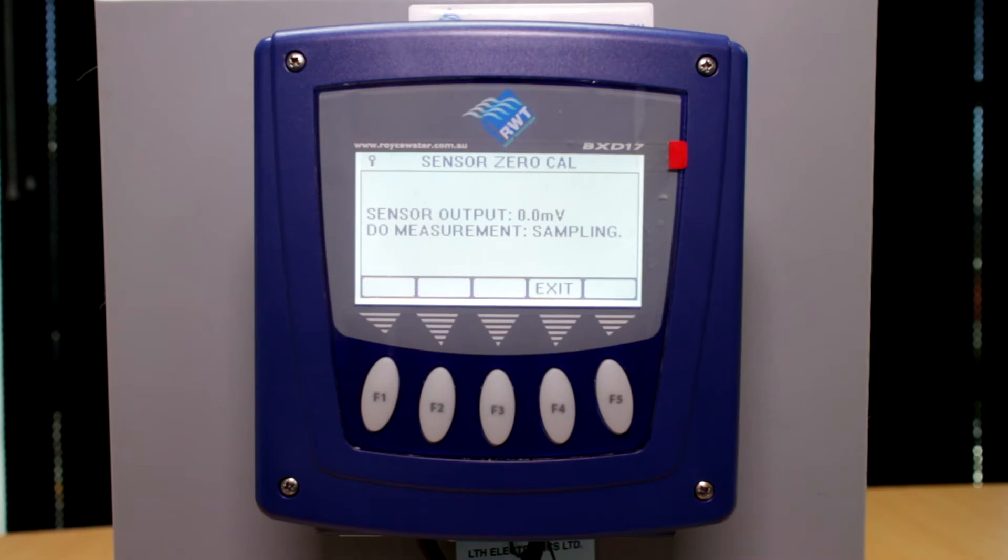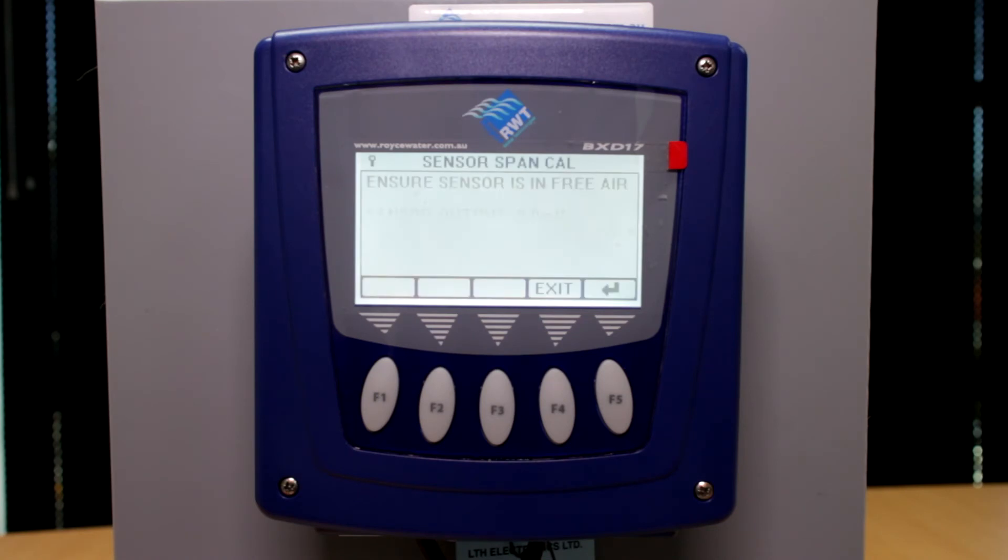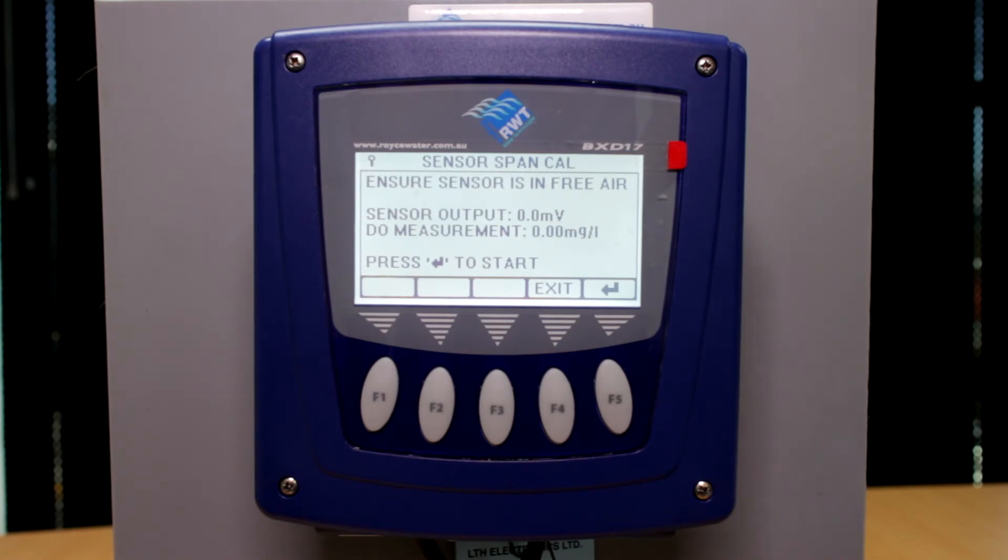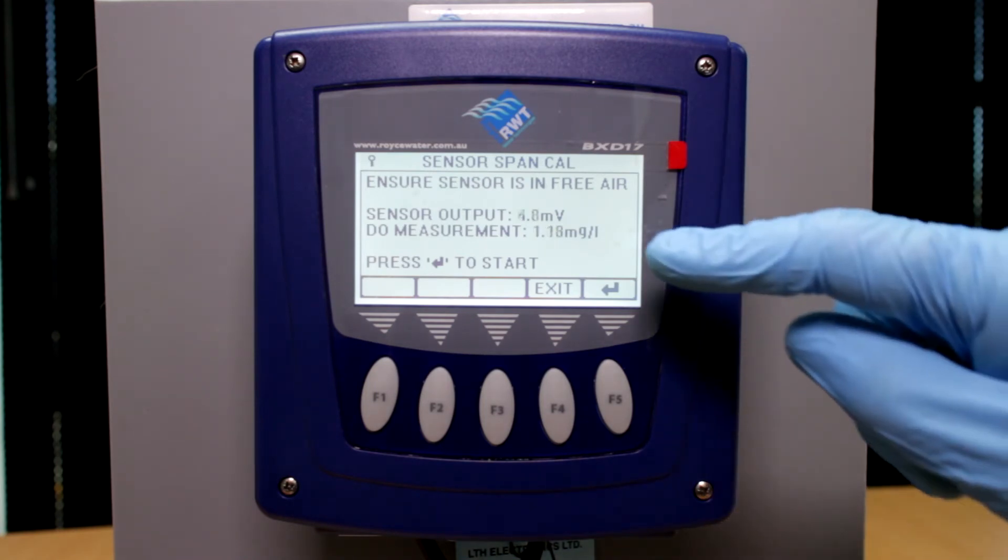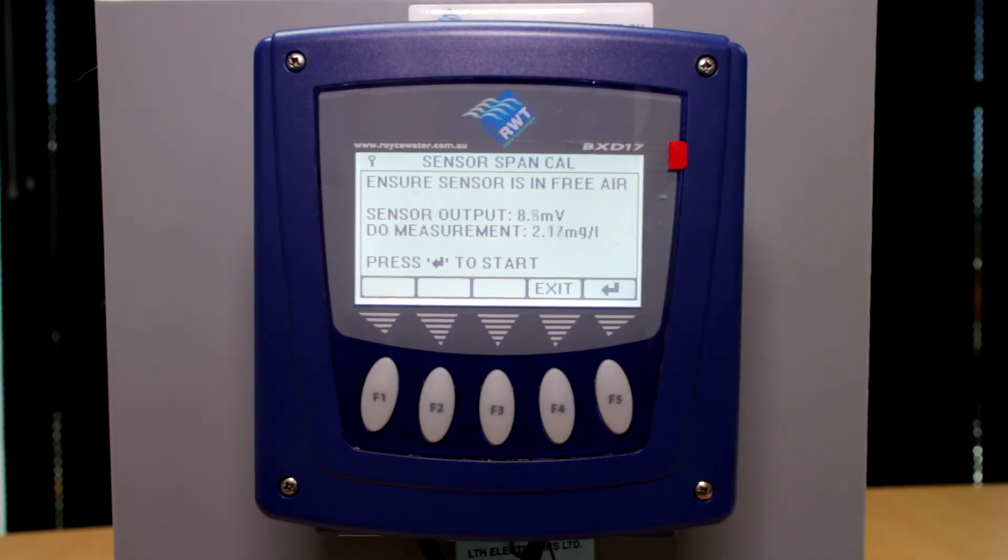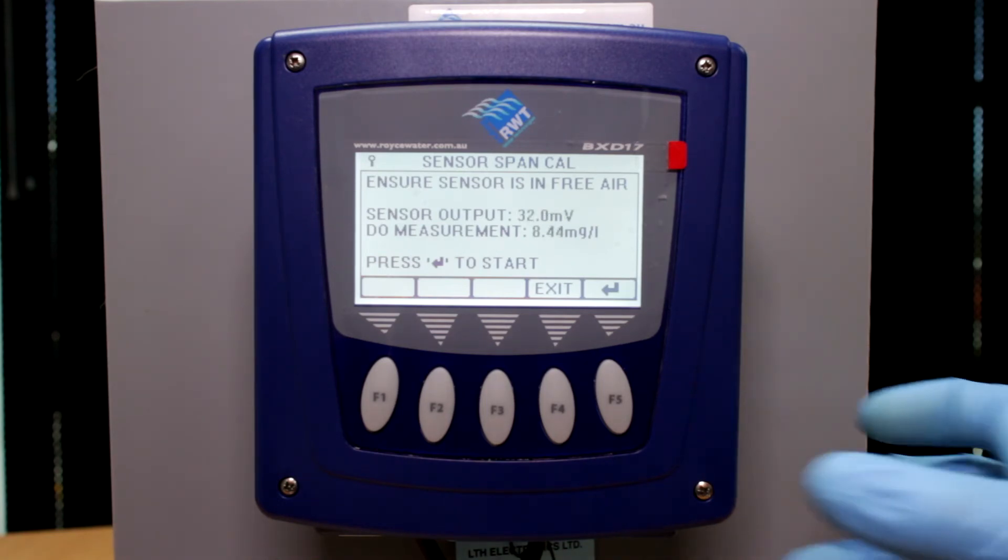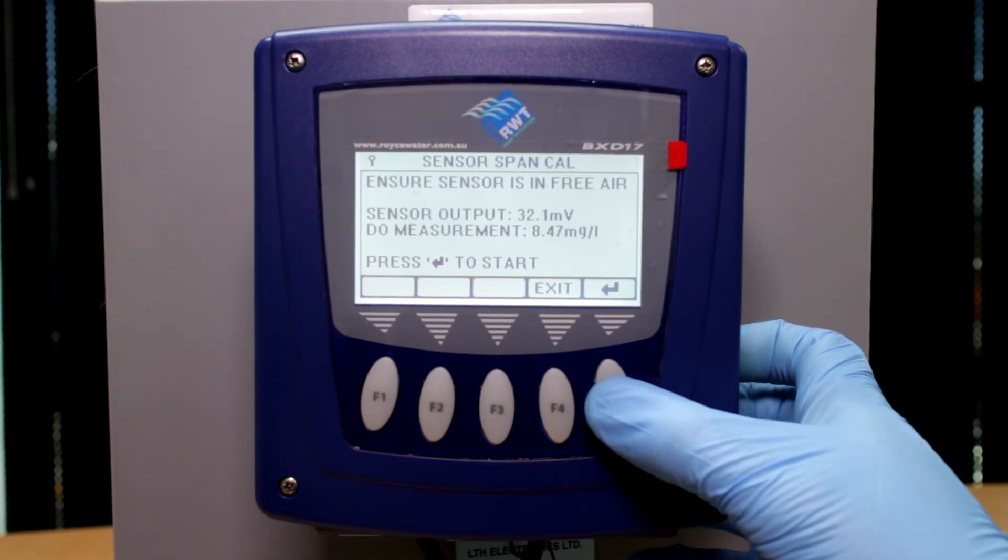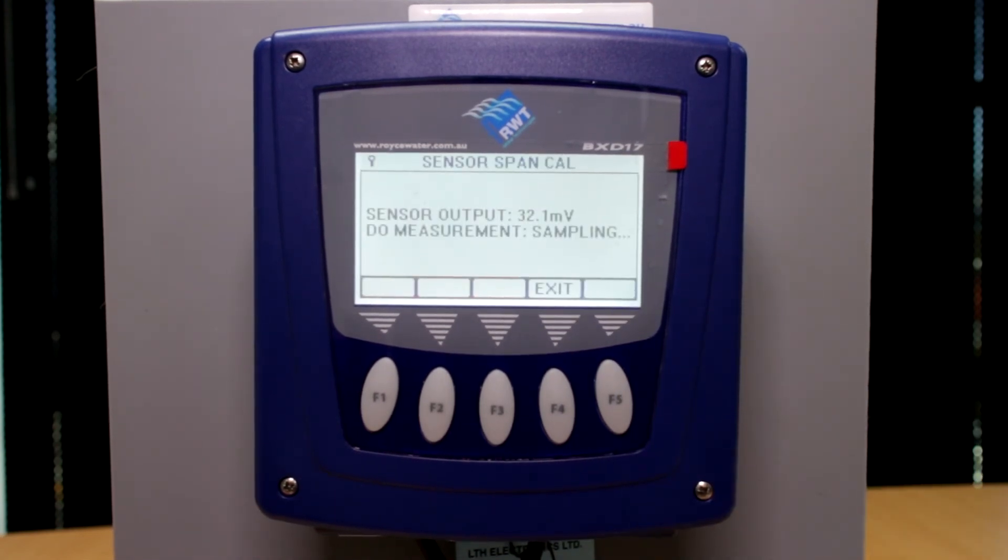Once the zero DO condition has been set, the BXD will instruct you to put the sensor in free air. Make sure the sensor is not in direct sunlight as this will cause errors. You'll notice the millivolt signal climbing. Once the millivolt signal has stabilized, we can push the enter button which is F5. This is now sampling free air conditions.